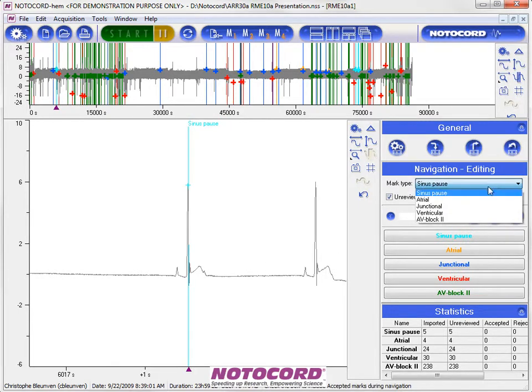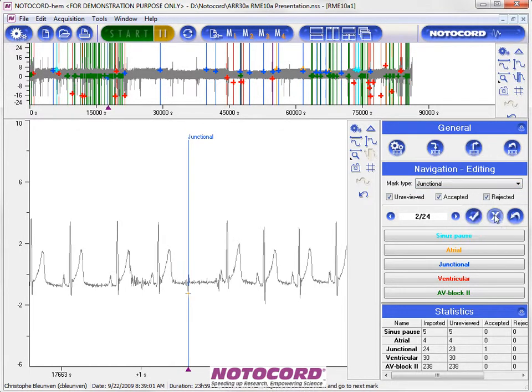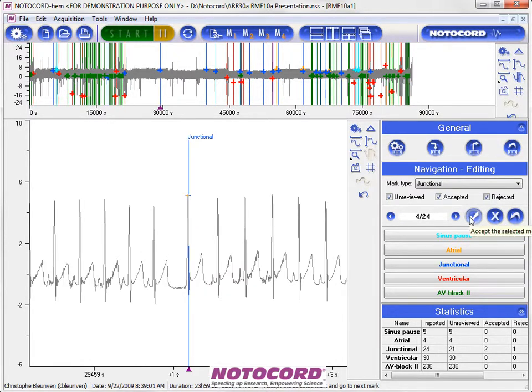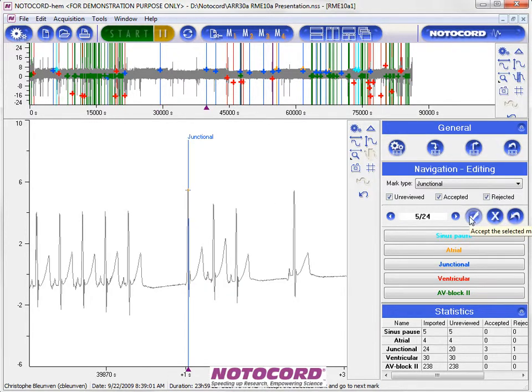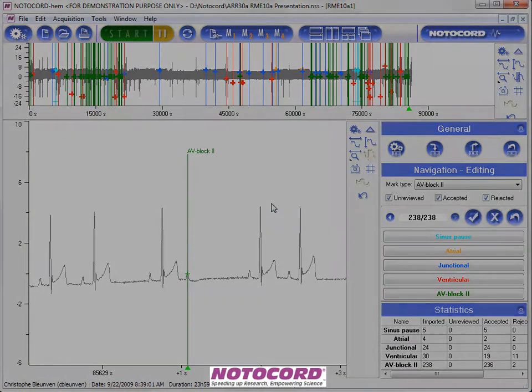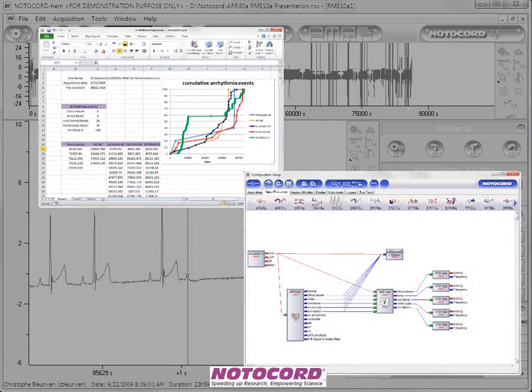Simply select the type of arrhythmia you want to review and accept or reject the selected mark. You're then automatically relocated to the following mark to review. At the end of the process, write the accepted marks on RME outputs. Validated marks are now available for Excel reporting or for all other processes you may want.